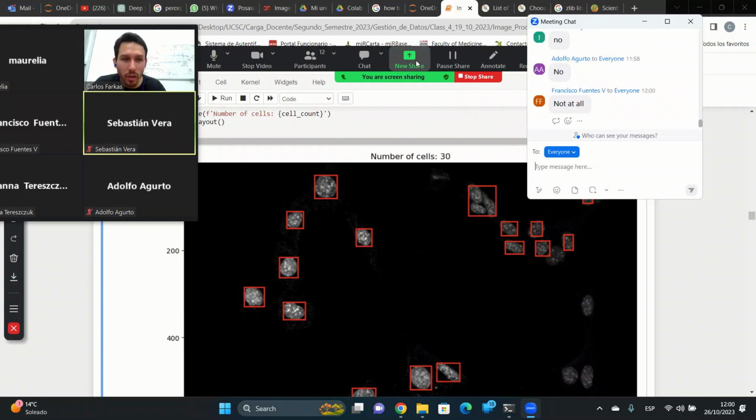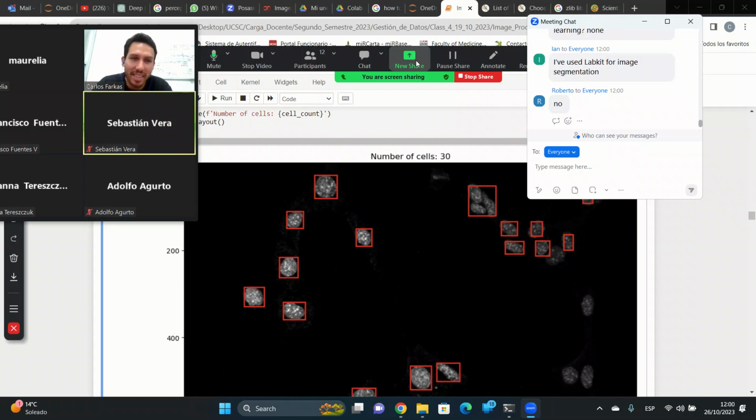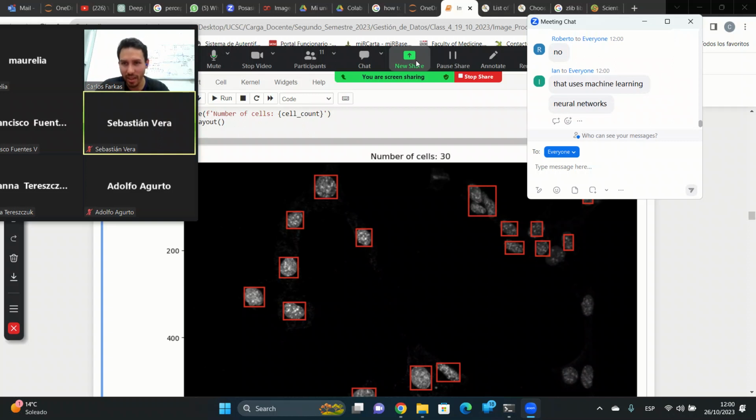Not at all, Francisco says. If you can answer, everyone will be in deep learning, machine learning, none. I've used LabKit for image segmentation. That's very nice. Ian, can you talk a little bit more about that? How it works? Do you have a sense if they use convolutional neural networks and some sort of fancy algorithm to do that, or that use machine learning? Okay, yeah, that's good. Machine learning usually precedes the deep learning analysis with neural networks. Okay, that's very nice.